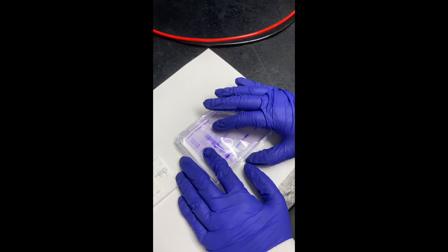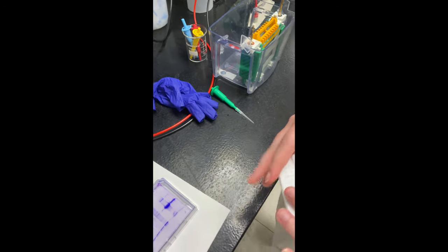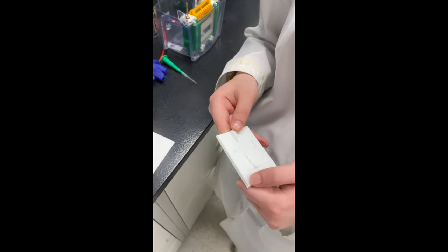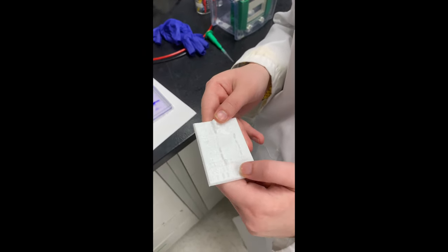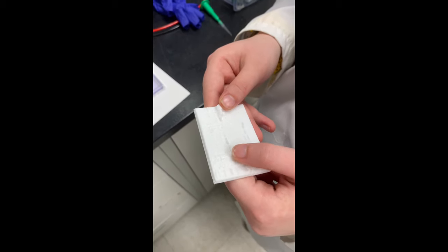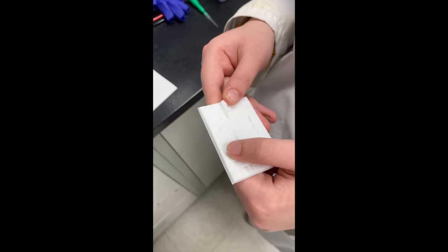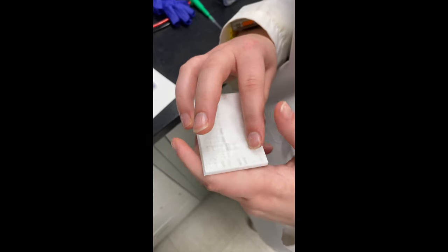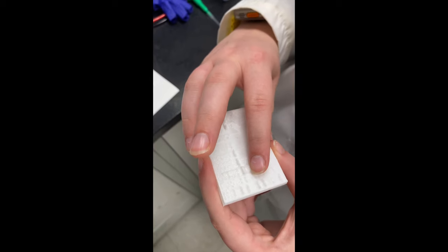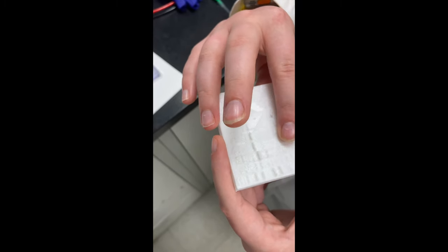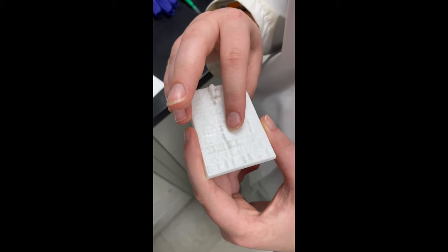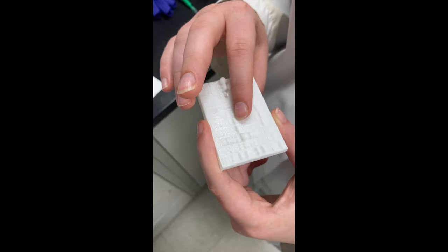Do you want to check out the print? Sure. Could you describe for our viewers what I'm looking at? Yeah, so this is a photo of a gel that I did in the past that I converted onto a 3D printer and printed it out. It's a rectangle and the pieces that poke up represent the intensity of the bands on the gel, like the blue bands I was showing on the original gel. There's 10 lanes. On the left side is the ladder—markers for known molecular weights or sizes of proteins.